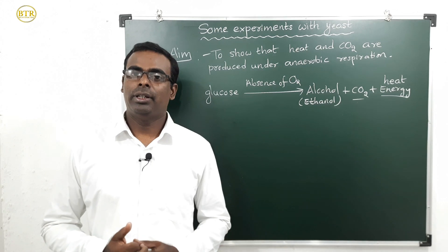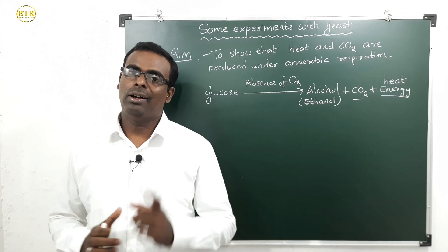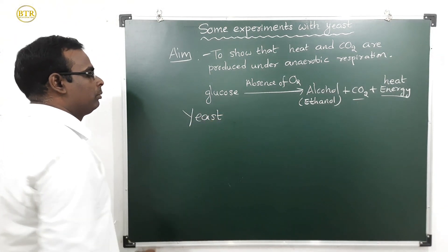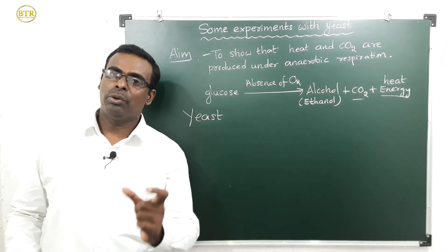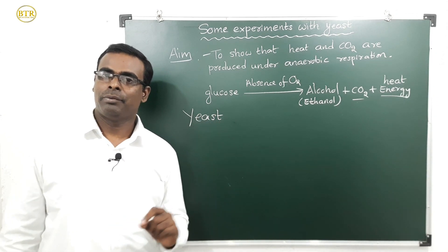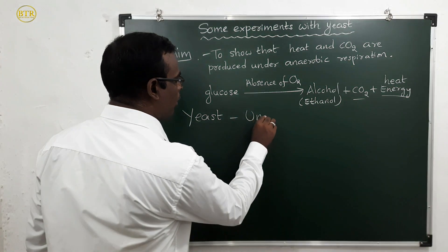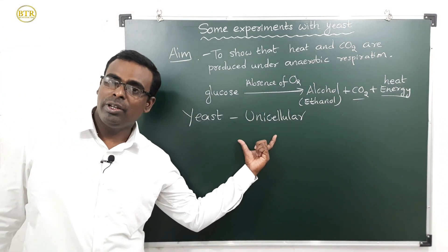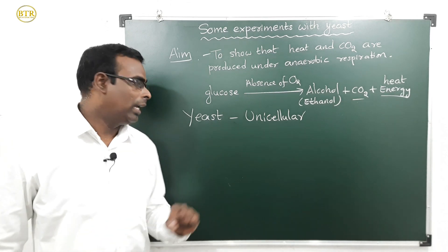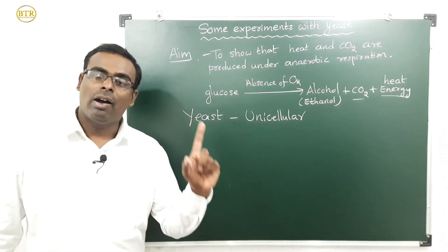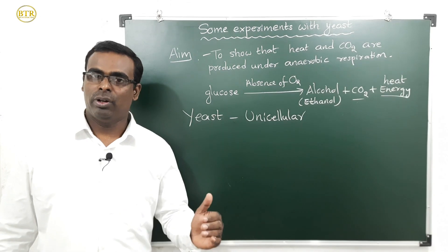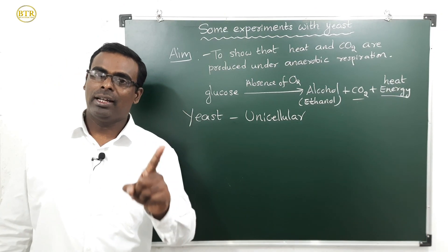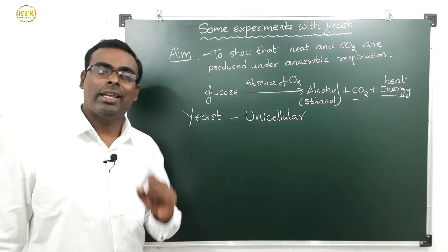In this lab activity, we are going to take the help of one living organism — that is yeast. Yeast is a unicellular organism, meaning it is made up of a single cell, like amoeba, chlamydomonas, or bacteria. It is a unicellular fungus — not a bacteria, not an algae.